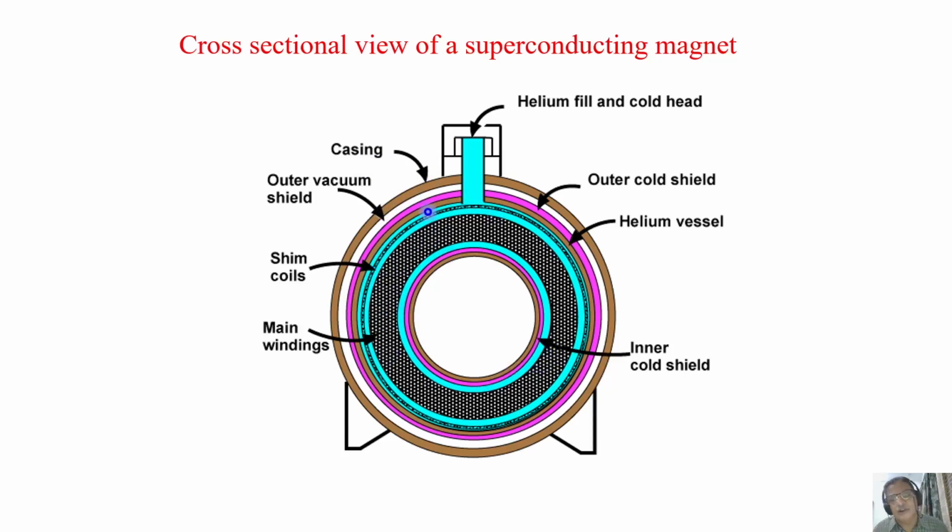Between the liquid nitrogen and liquid helium chambers, there is enormous shielding to prevent evaporation, and you have to make sure that helium and nitrogen do not evaporate faster. Everything must be in a high vacuum. All those things are taken care of.